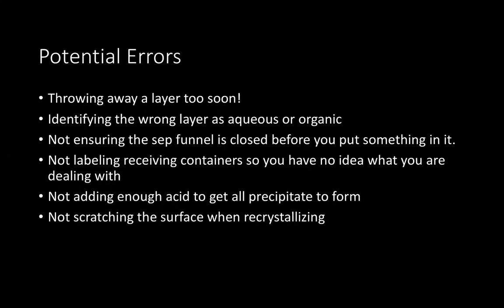Potential errors for this lab: first, throwing away a layer too soon. Just like in recrystallization, as long as you don't throw anything away too soon, all of your materials are still there — all three compounds you weighed out. Be careful with labeling and don't throw anything away. Sometimes people will identify the wrong layer as aqueous or organic and try to isolate the wrong layer, which doesn't destroy what's in the layer but won't give you the right results. Another common error is not making sure your sep funnel stopcock is closed before adding liquids — the stopcock should be parallel to the lab bench when closed so your liquid doesn't drain out.